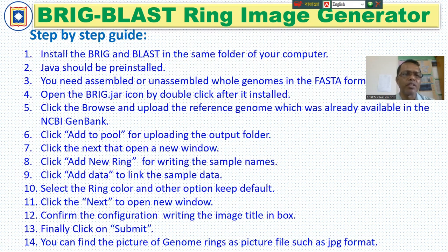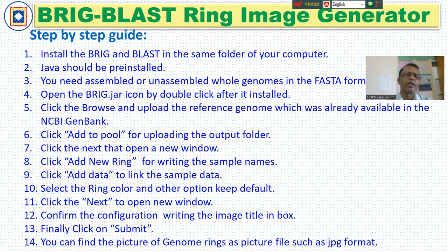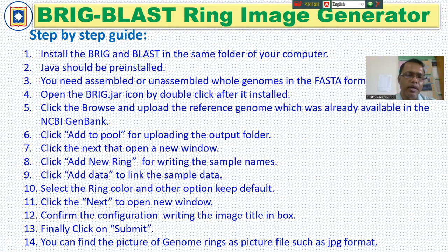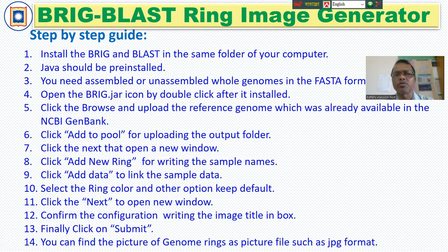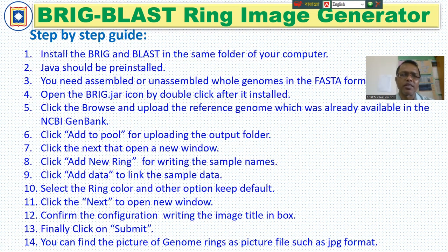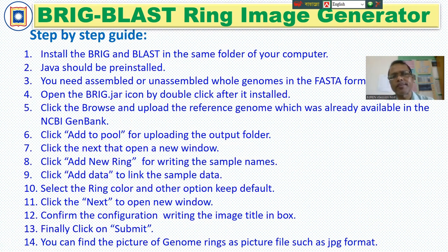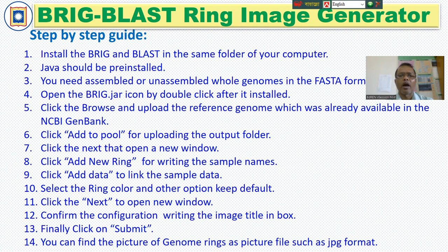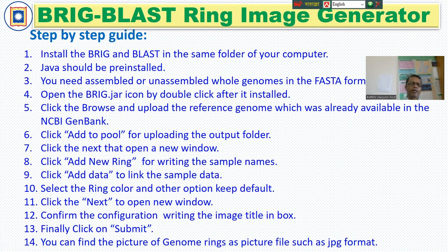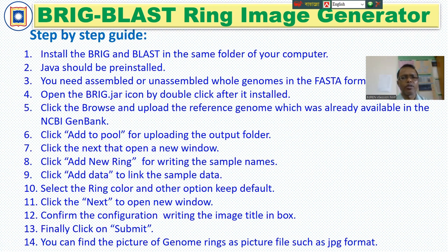First, we have to install BRIG and Blast in the same folder on your computer. And Java should be pre-installed. If you need any help, then maybe you can see my other videos. How can you install the Java and test to link the Java. And you need to assemble and unassemble whole genomes in the FASTA format. And next, open the BRIG jar icon by double-clicking after it is installed. And click the Browse and upload the reference genome, which was already available in the NCBI GenBank. Next, click Add to pool for uploading output folder. And then click Next to open a new window. And then click Add New ring for writing sample names. Then click Add data to link the sample data.